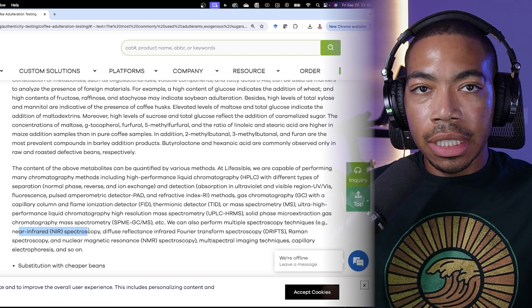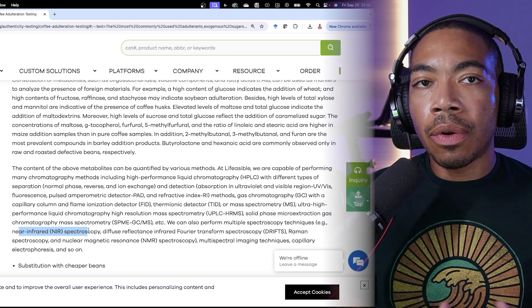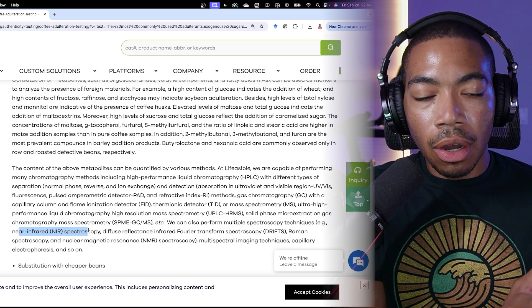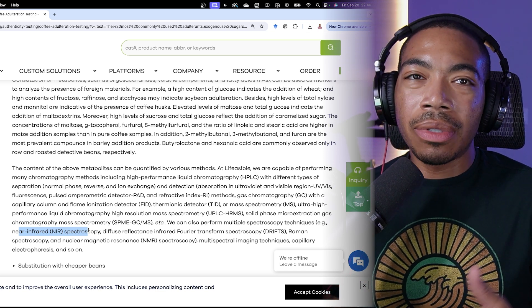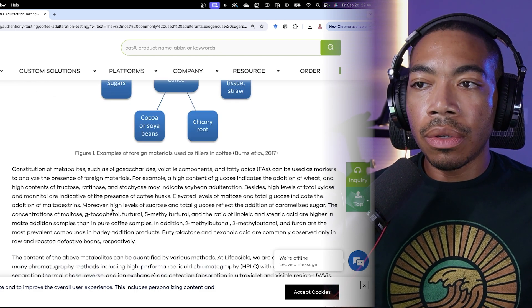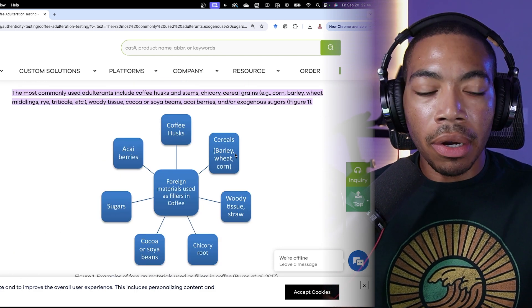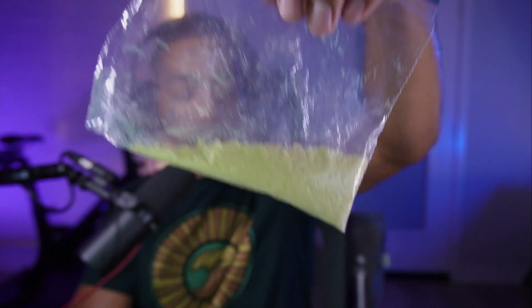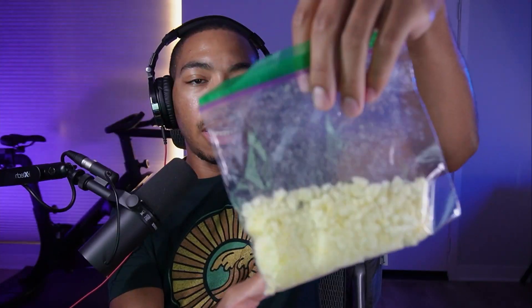Of course they also mention various spectroscopy techniques, including near-IR spectroscopy — which we have one of those right here. So why not give it a shot? Let's do some method development work quickly to see if we can separate authentic coffee from these typical cereal-style fillers: corn, whole grain, barley. Fortunately these are also the base ingredients for many different cereals you'd find at home — Chex Mix, Kicks, Pirate's Booty.